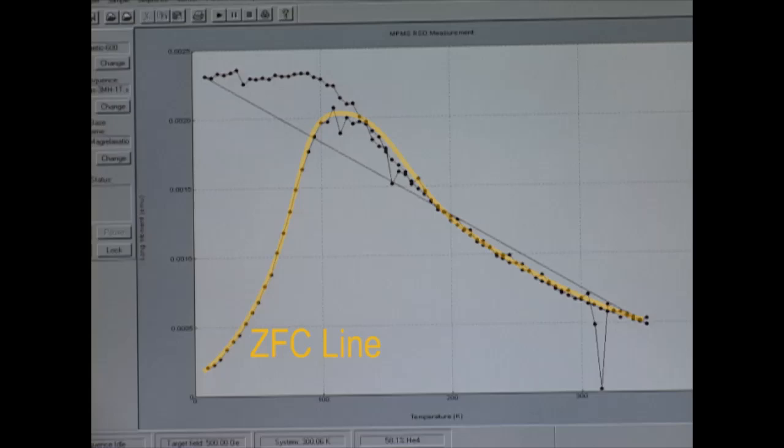In this output, the zero field cooled ZFC line shows the magnetism over a range of temperatures with no magnetic field. The field cooled FC line shows the sample magnetism with an applied 500 OE field as the temperature range is scanned.